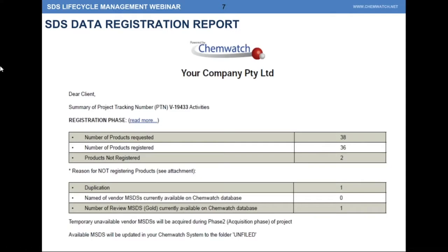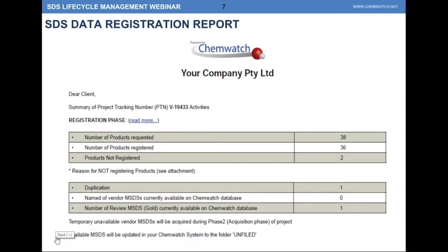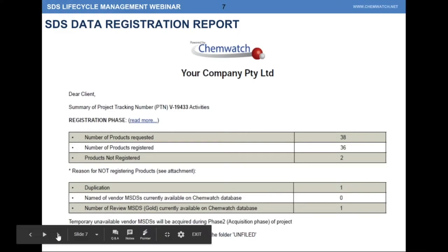So for instance, for registration, you can see here the number of products requested, those that have been already registered, those that have not been registered, what is duplicate, what is available in our database as well. We also let you know what is temporarily unavailable. And we provide these reports weekly, but we ask the customers to define the frequency as to how they want to be notified of what's going on.